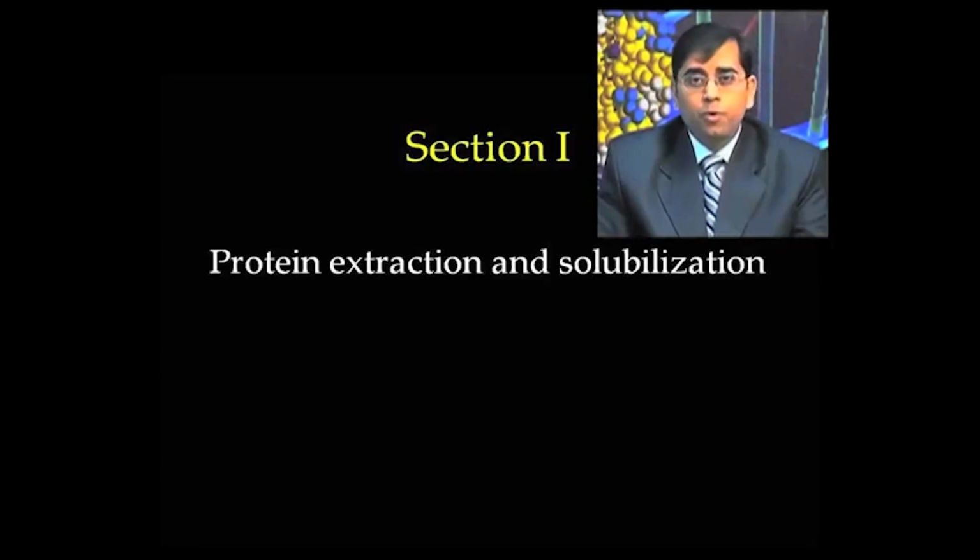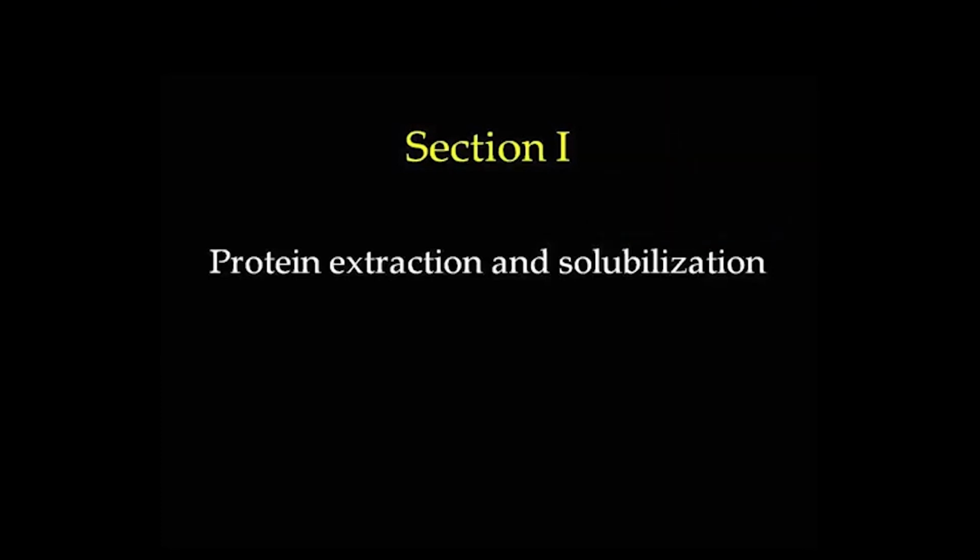Now, this step will be more towards gel based proteomics, where solubilization will be more important.